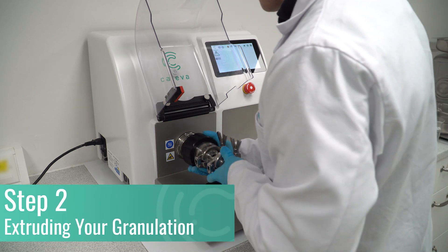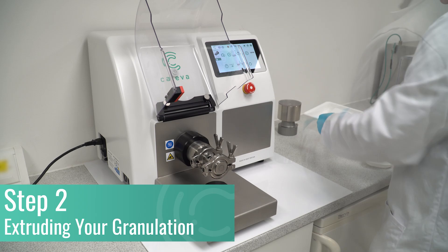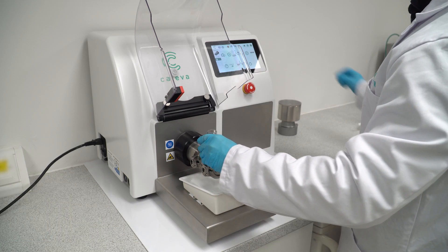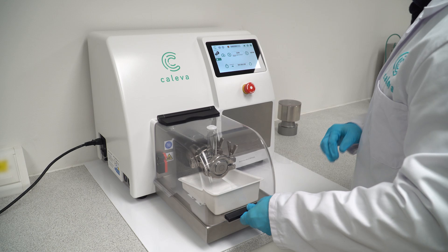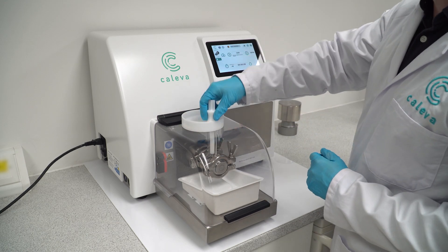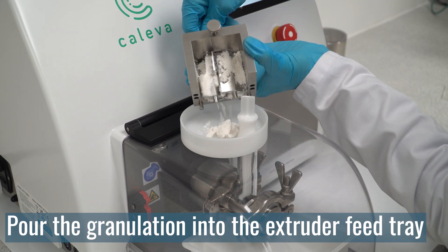Fitting each attachment takes a matter of seconds, allowing operators to turn powder into pellets in as little as 15 minutes. Pour the granulation from the mixer bowl into the extruder feed tray.